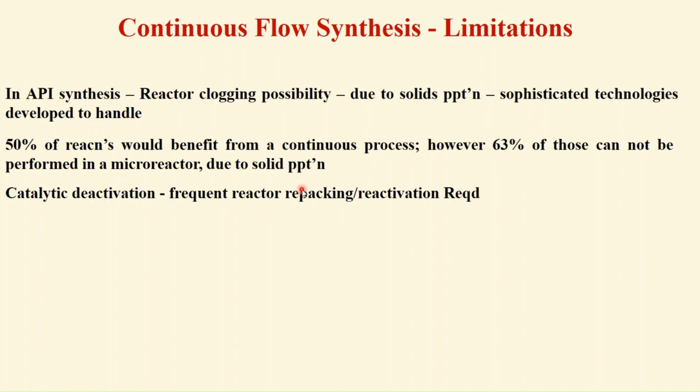We use catalytic bed reactors, and continuous usage of this deactivates the catalyst, and frequently we have to repack, if not repacking, at least reactivate the catalyst which has been loaded into the catalytic bed reactor. This has to be done frequently. That is another problem which has been faced in the continuous flow system of synthesis.